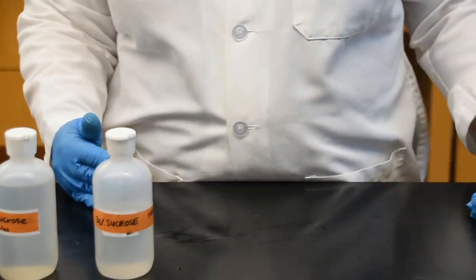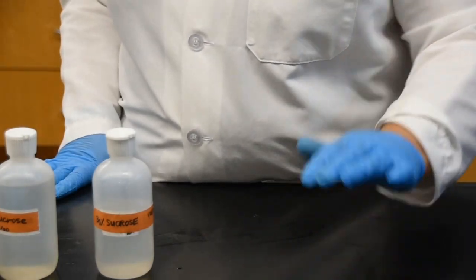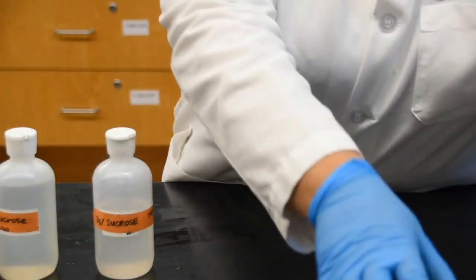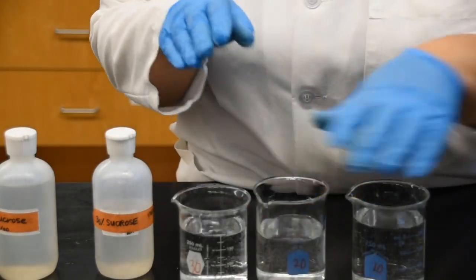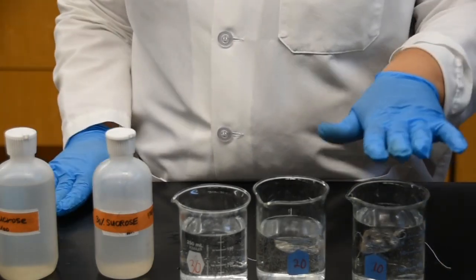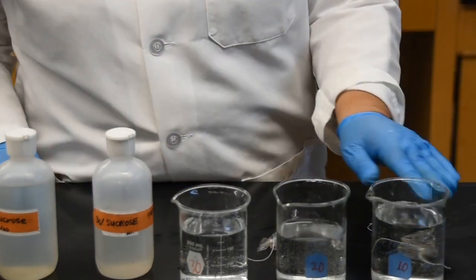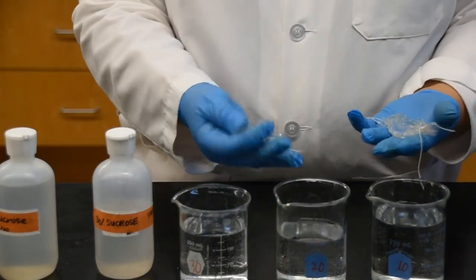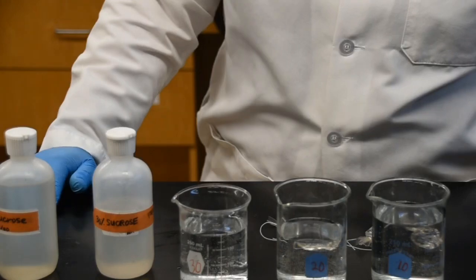Now the idea here is, after I'm done setting this up, I'm going to place each of these little baggies inside a water solution. This is simply DI solution, or DI water. So I have the 10%, 20%, and 30%. After weighing my little baggies, I'm going to drop them into the water and wait for 45 minutes.